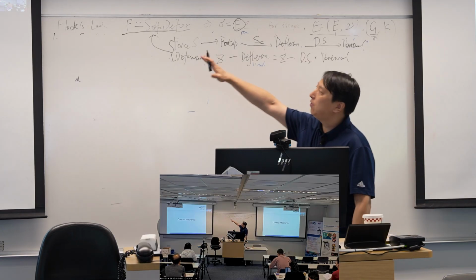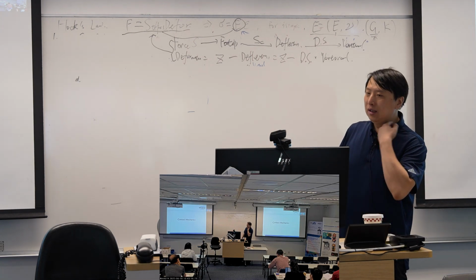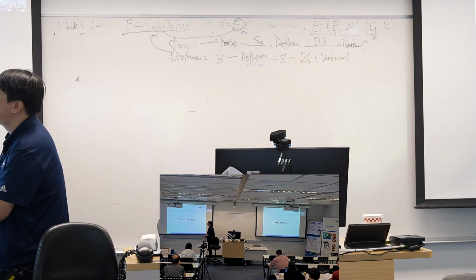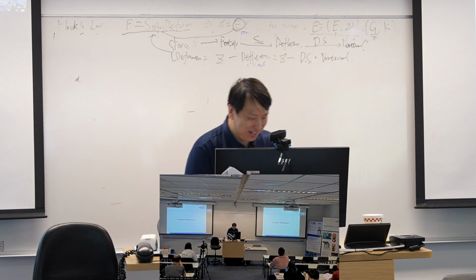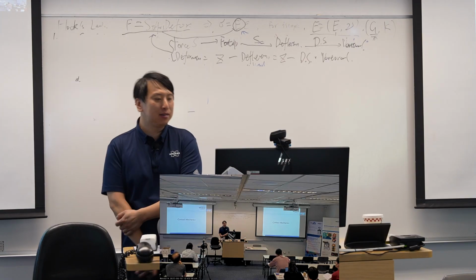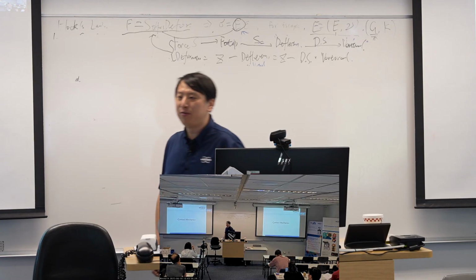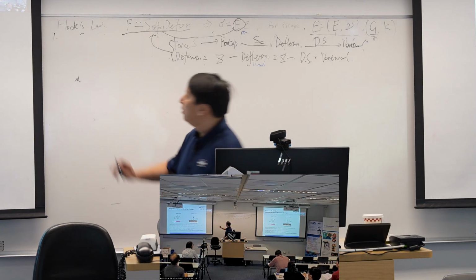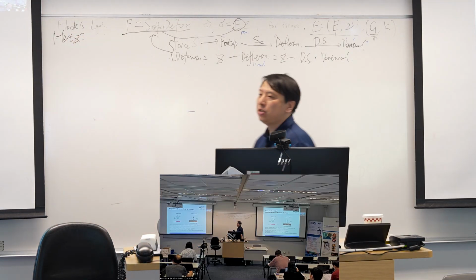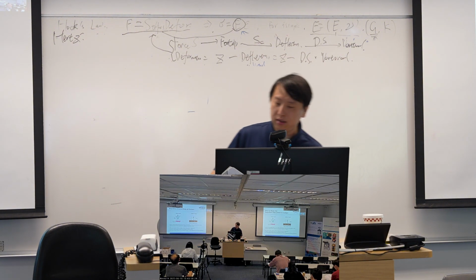So from the stiffness to modulus, we need to use the power of theory. And this theory was established in the 19th century. Sorry, we are using some classic theories. So this theory, they call it contact mechanics, and this is the main theory established by our famous Hertz. And Hertz established this contact mechanics, and his basic idea is quite simple.